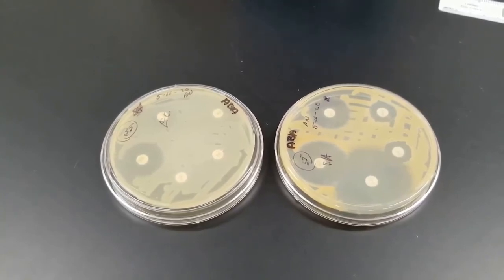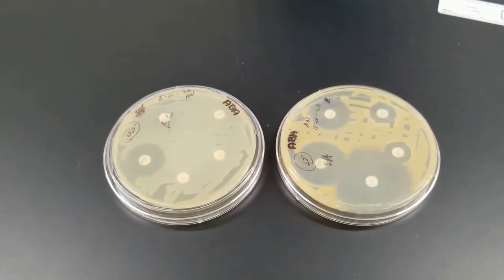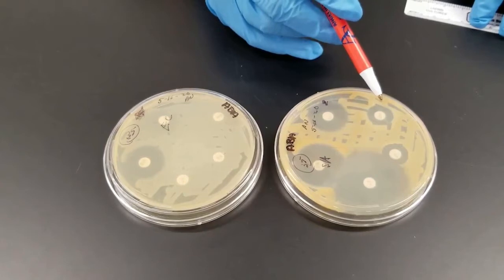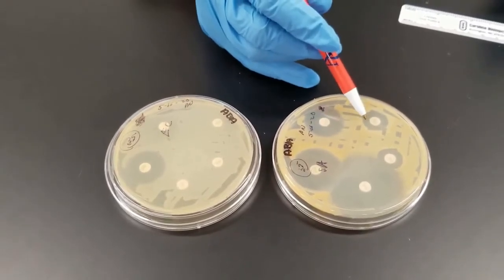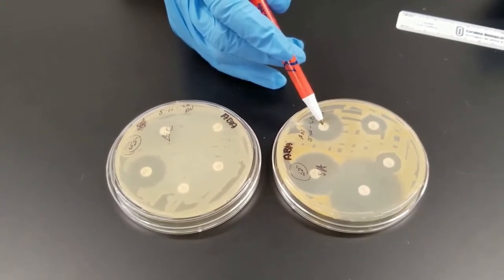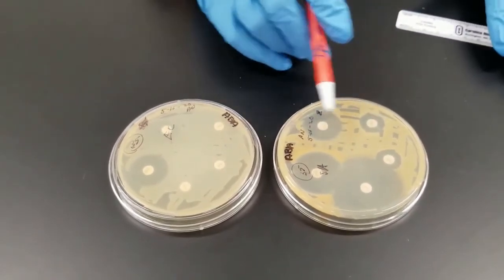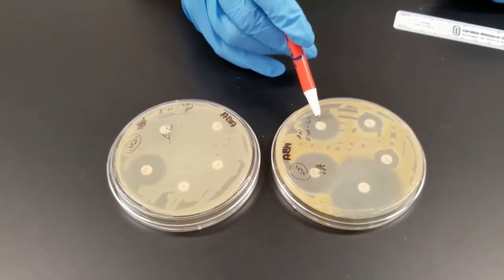Some antibiotics work on the cell wall, and because of the differences in the chemical compositions of the cell wall between gram-positive and gram-negative, you see differences in the effectiveness of the antibiotics. Now we're going to go around the circle and look at this. What you're looking for, you have these discs which had been pre-soaked with the antibiotic at certain concentrations. You're looking for this zone of inhibition. So when I talk about a zone of inhibition, you're looking at this area where there is no growth. Why? Because the antibiotic diffused out of the disc into the medium, and we had inoculated the plates initially to get a full, heavy growth of the bacteria. But it cannot grow in this area because this particular antibiotic is inhibiting.